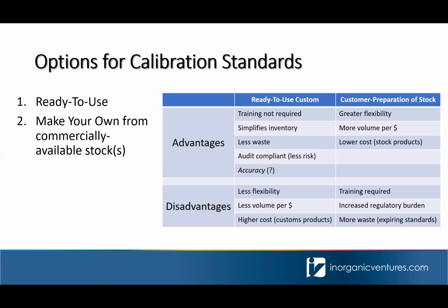Some factors that will go into deciding whether you're using ready-to-use solutions or making your own include your lab's analytical goals, the budget that you have, your level of accreditation, the audit protocols you have, the level of training of your staff, the equipment that you have, and so on and so forth.